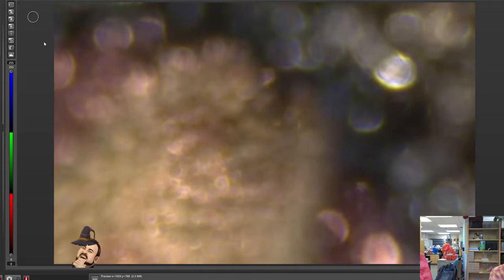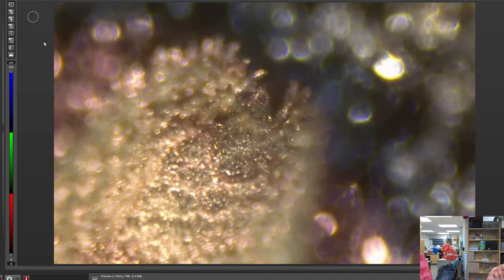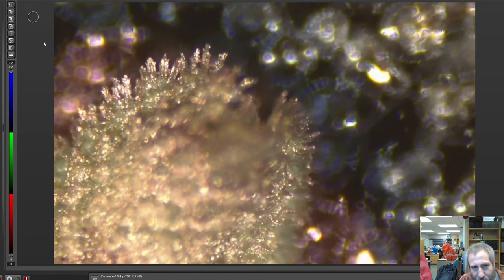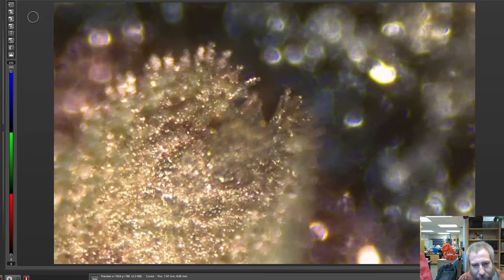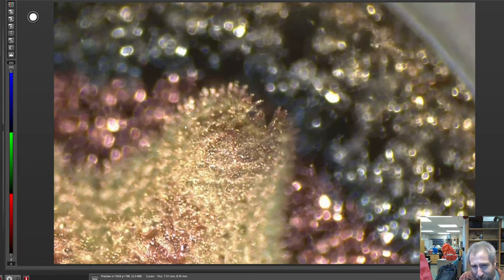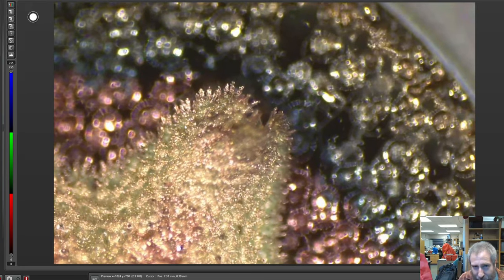And I think this is a strong case, honestly, for using the scanning electron microscope to take a look at these things, because I feel like you can see stuff, but it's kind of confusing what you're looking at, because so little of it's actually in focus at the same time. And then, of course, I've coated this thing in gold, so it's also confusing in the sense that all the surfaces have no color, and normally we would use the color to help us figure out what we're looking at.